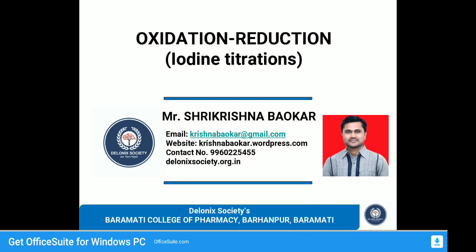Here I would like to welcome all of you for today's session, which is entitled Oxidation Reduction Type of Titration. Particularly, here I am going to explain iodine type of titrations.